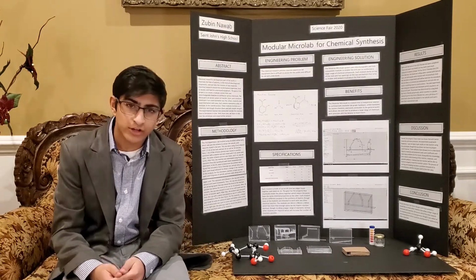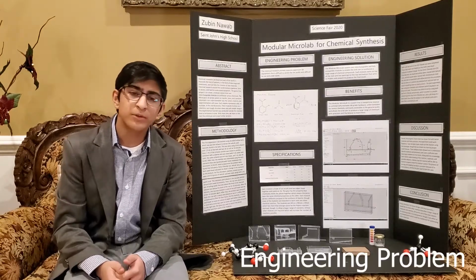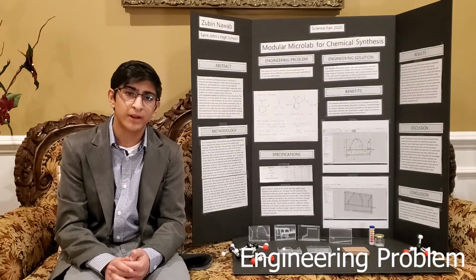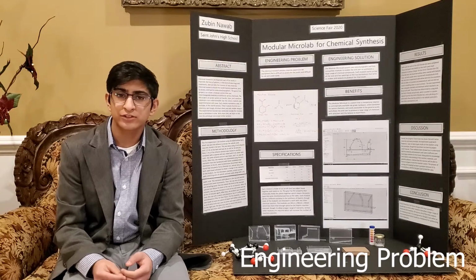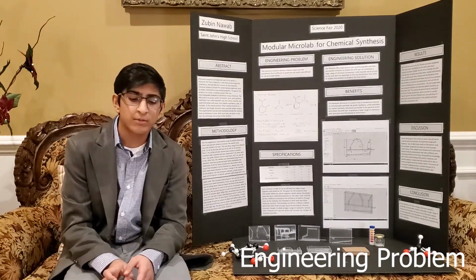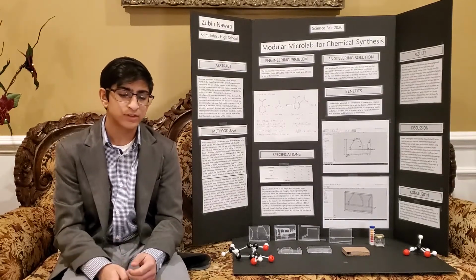I started this project wanting to do chemistry and engineering and learn about those two fields. When developing the project, I realized how the system could be used to help others facing a problem that I also had. So the engineering problem that I faced was that I wasn't able to get access to lab equipment. The Modular MicroLab helps solve this problem by being able to function as multiple pieces of lab equipment, but in a more compact, easy to use way.